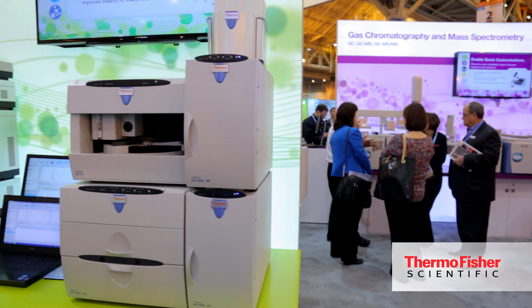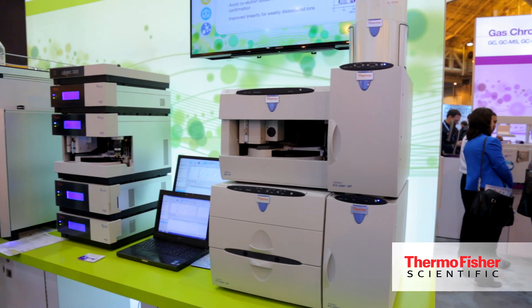Before this technology, there was barely any chromatographic analysis, especially of larger carbohydrates. What this technology does is detect carbohydrates without doing a labeling reaction to make them a fluorophore or UV absorbent. We detect them electrochemically by a simple oxidation of a small amount of that carbohydrate. The separation is done at high pH so we can separate them as anions.